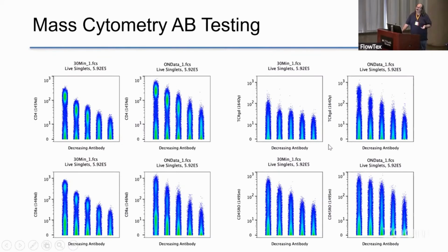So there's a fundamental difference between fluorophores and mass cytometry, and it's essentially how the metals are attached. There's this huge polymer that we embed the metals into to conjugate to the actual antibodies. And I have a feeling that large polymer is just randomly sticking to stuff. It actually seems to be less of a problem at 30 minutes than overnight. And I have a feeling it's because it has low kinetics, so it's taking a long time for it to reach its maximum.